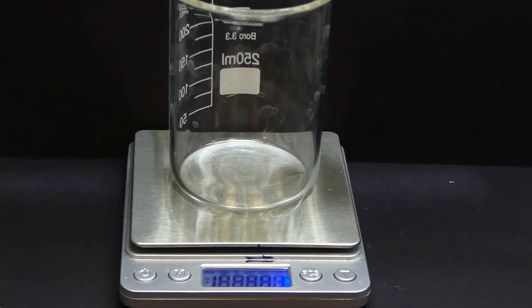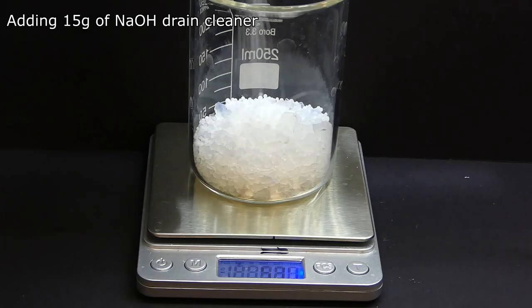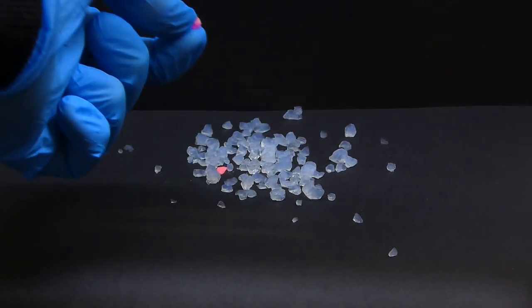To make the reaction, we first need to add 30 grams of the silica gel to a beaker, followed by 15 grams of sodium hydroxide. If you want to make the sodium silicate more pure, you can remove the colored pellets, but in the end, it makes no significant difference.